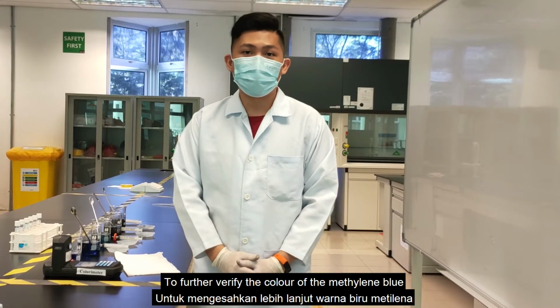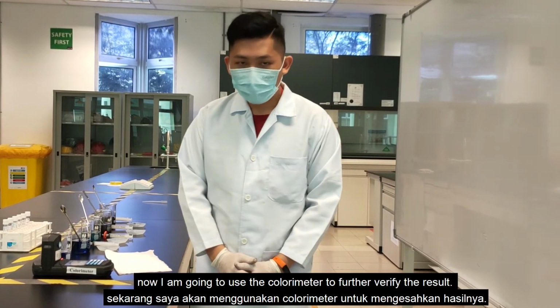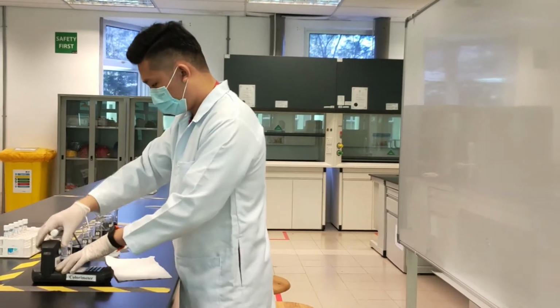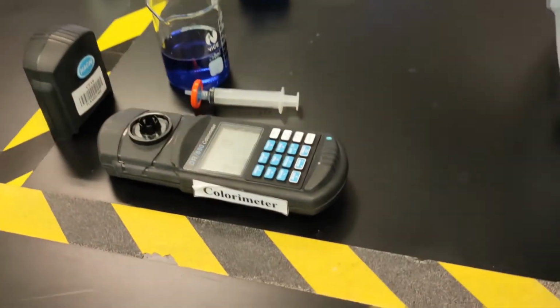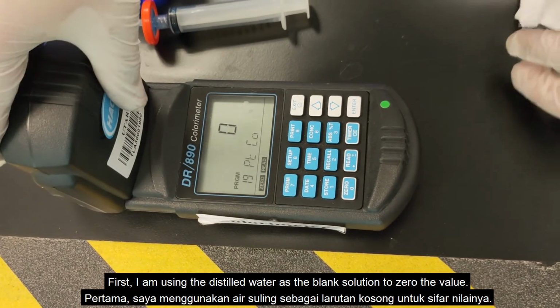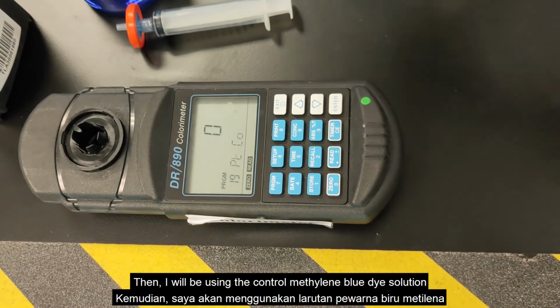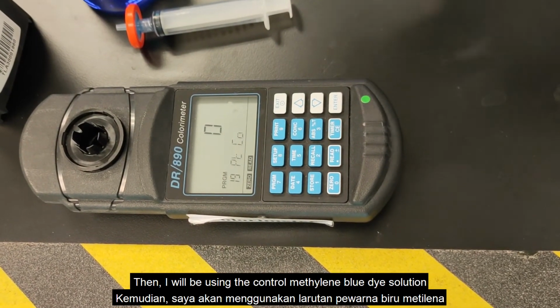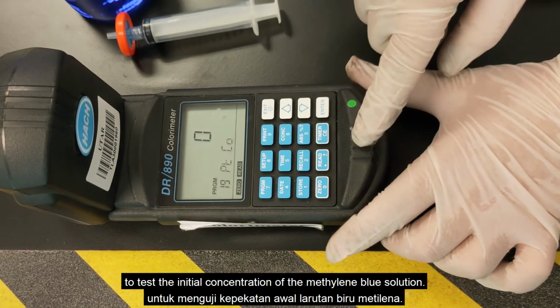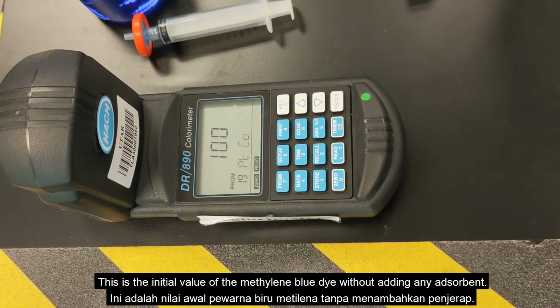To further verify that the color of the methylene blue has successfully been adsorbed on the activated carbon, now I'm going to use the colorimeter to further verify the result. First, I will be using the distilled water as the blank solution to zero the value. Then I will be using the control methylene blue dye solution to test the initial concentration of the methylene blue solution. This is the initial value of the methylene blue dye without adding any adsorbent.